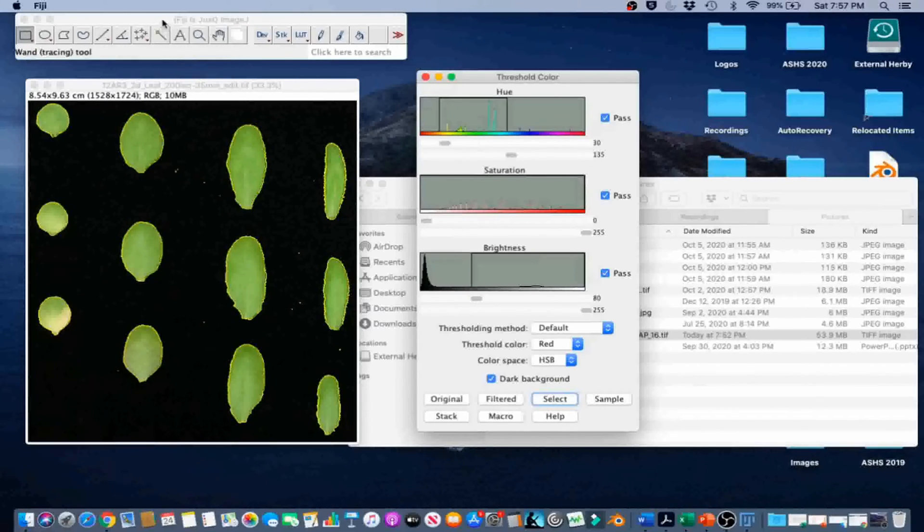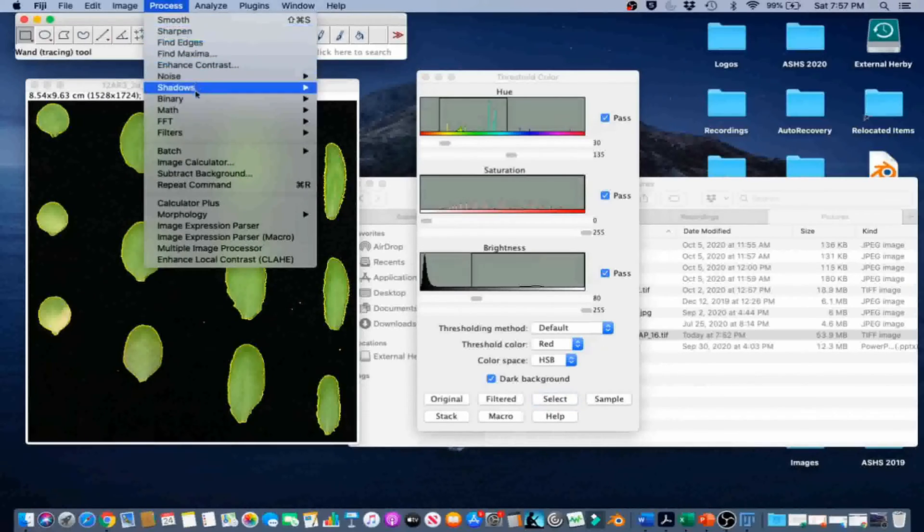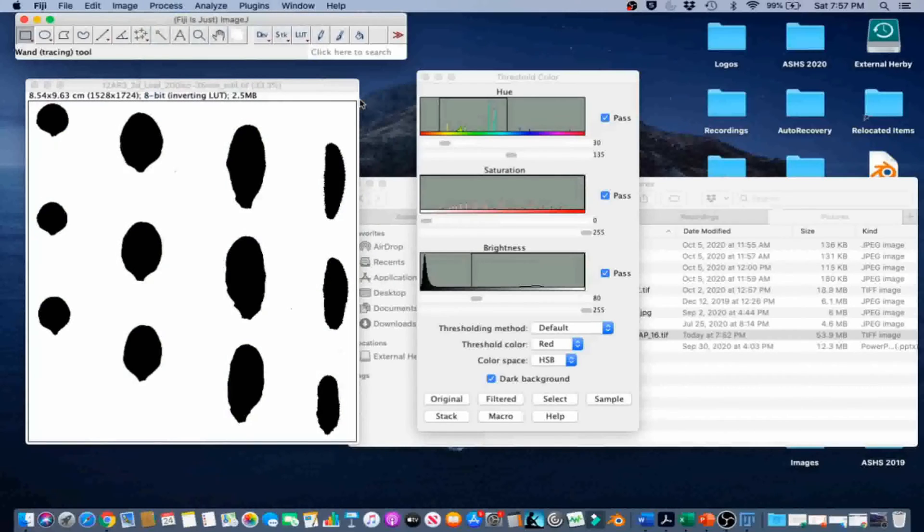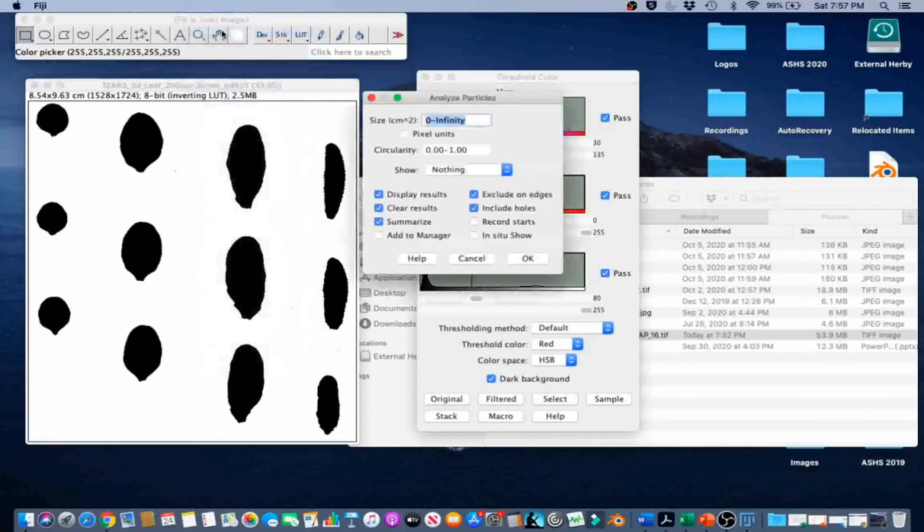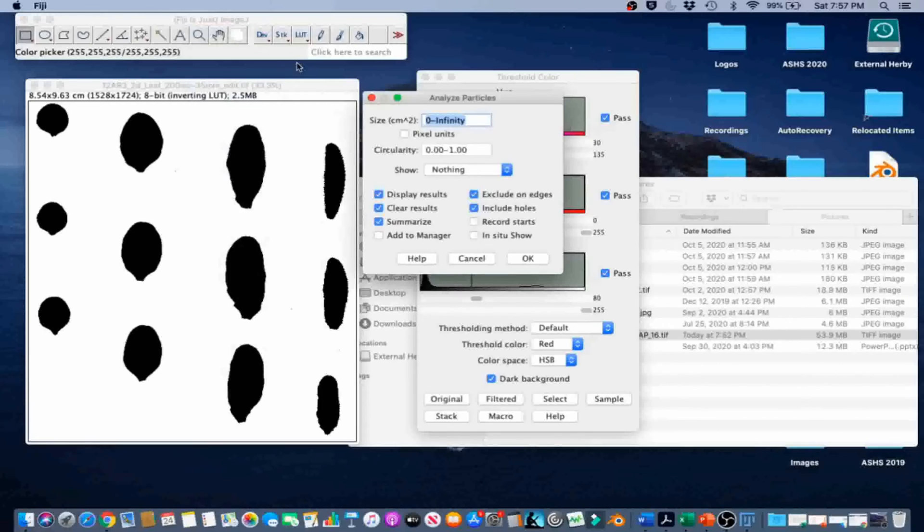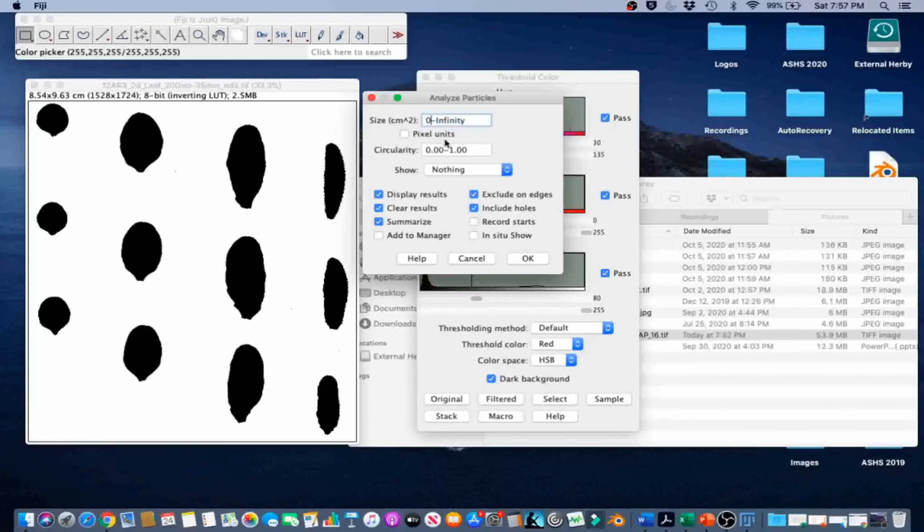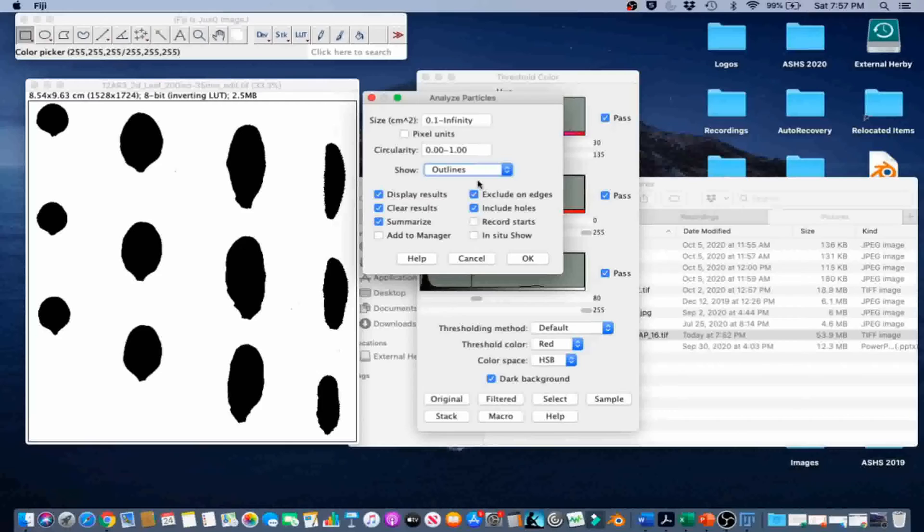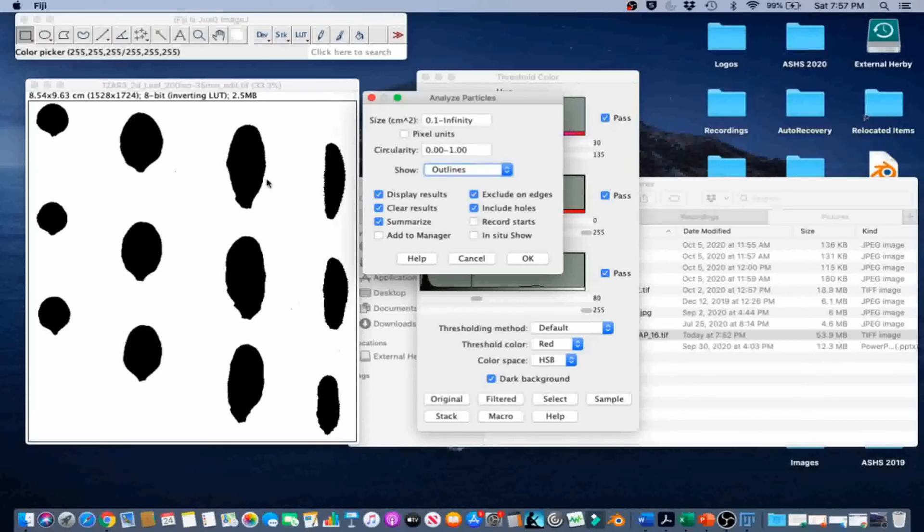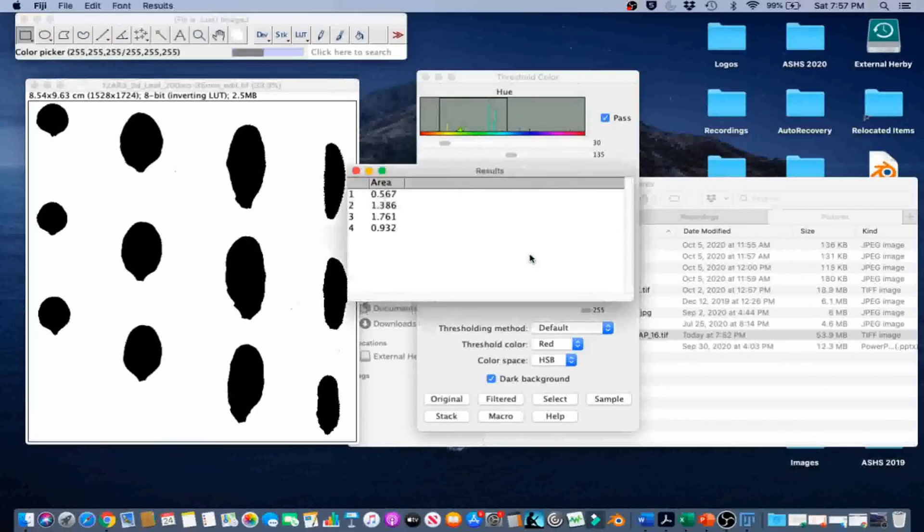Then we're going to go to Process, Binary, Make Binary to convert the color image to a binary image. And then Analyze, Analyze Particles to count the leaves and to measure the individual area of each leaf. We're going to enter 0.1 to infinity for size, 0 to 1 for circularity, and in this case Show Outlines. And we're going to leave the pixel box unchecked. We started the size from 0.1 so that we could exclude some of the little particles that are not the leaves. We're going to go ahead and click OK.